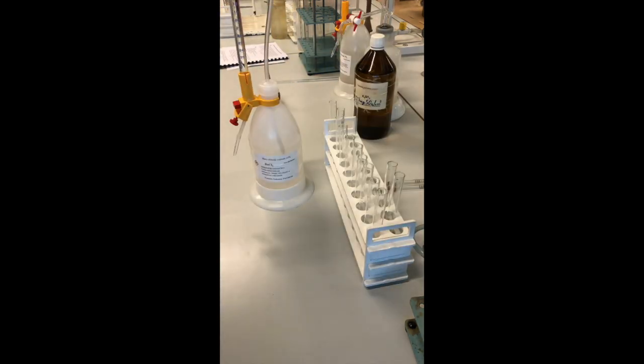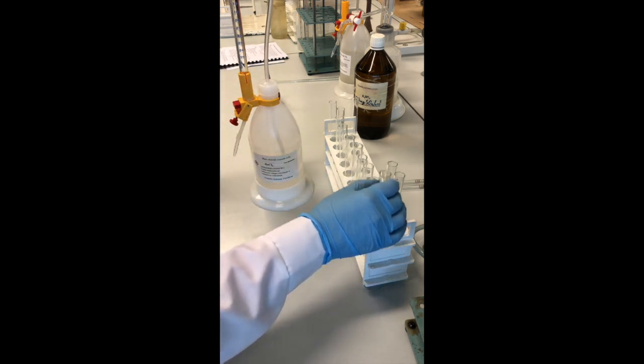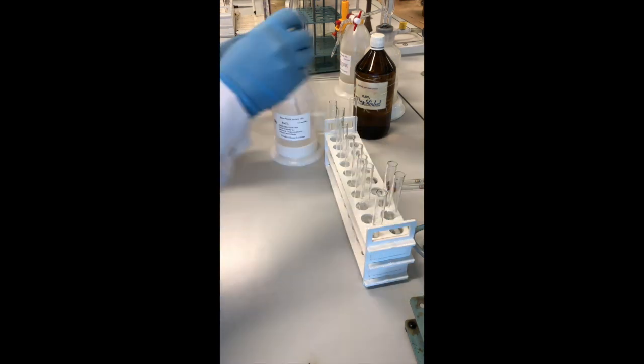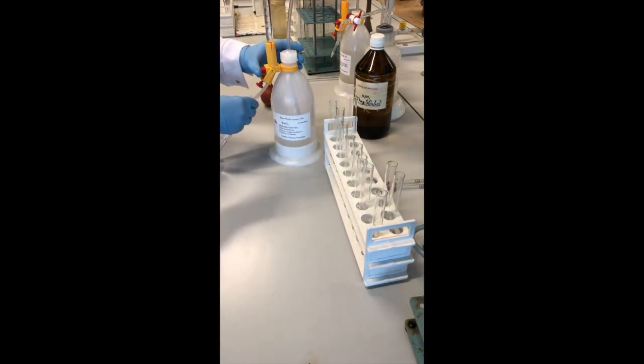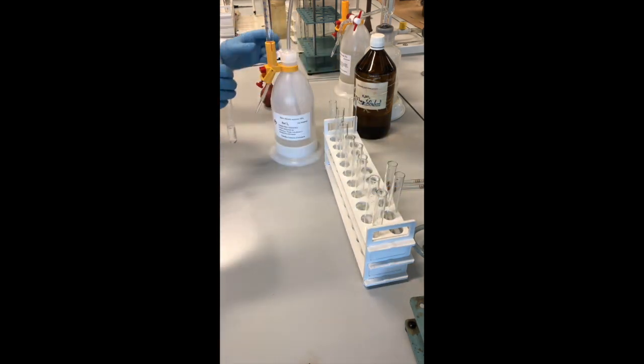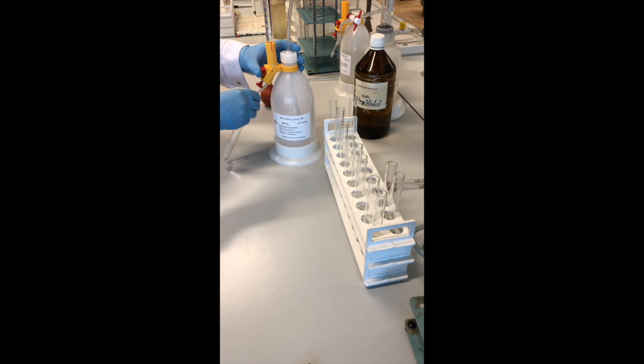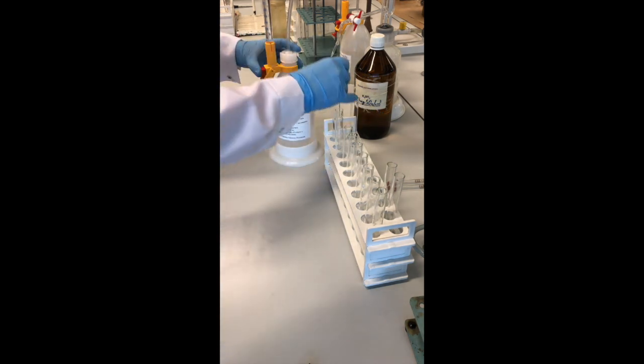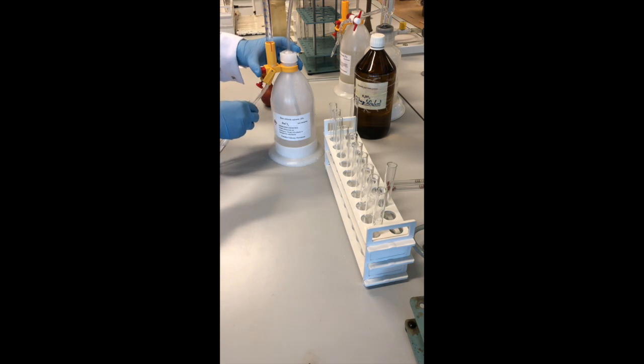And the final step, to all of the samples you add 0.5 cubic centimeters of barium chloride, to our samples as well.